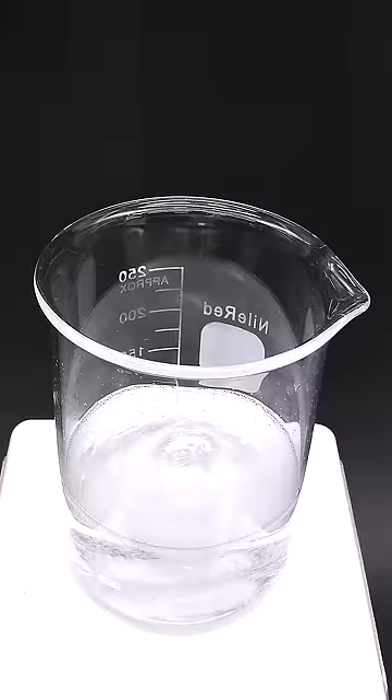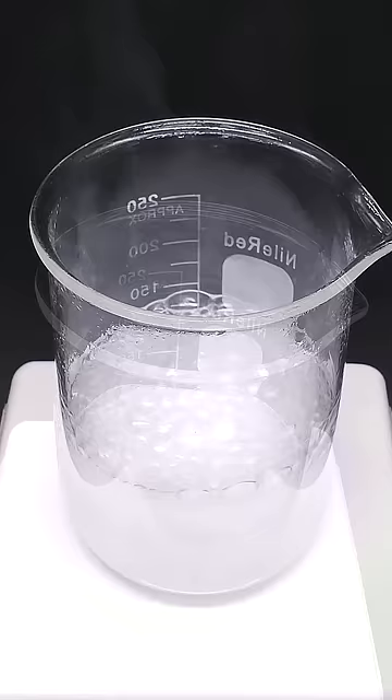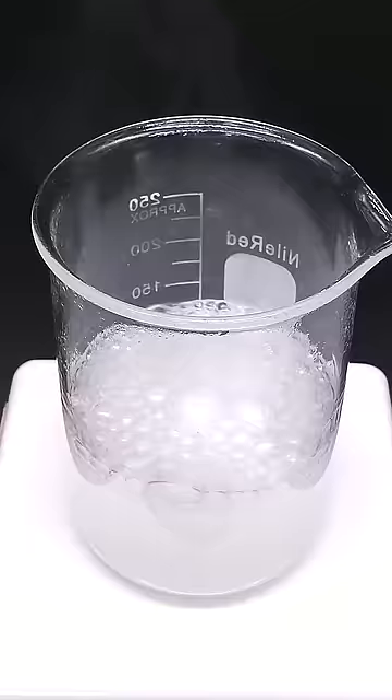It also gets really hot, and this mixture is able to destroy most organic things. I always find it fun to add stuff like paper to it, because it just instantly turns it into carbon, and then it vaporizes it into CO2 gas.